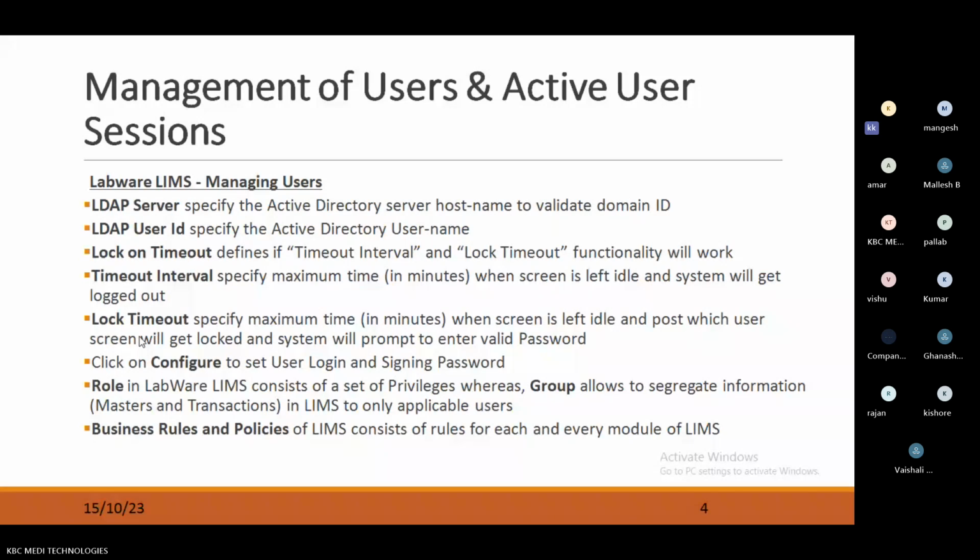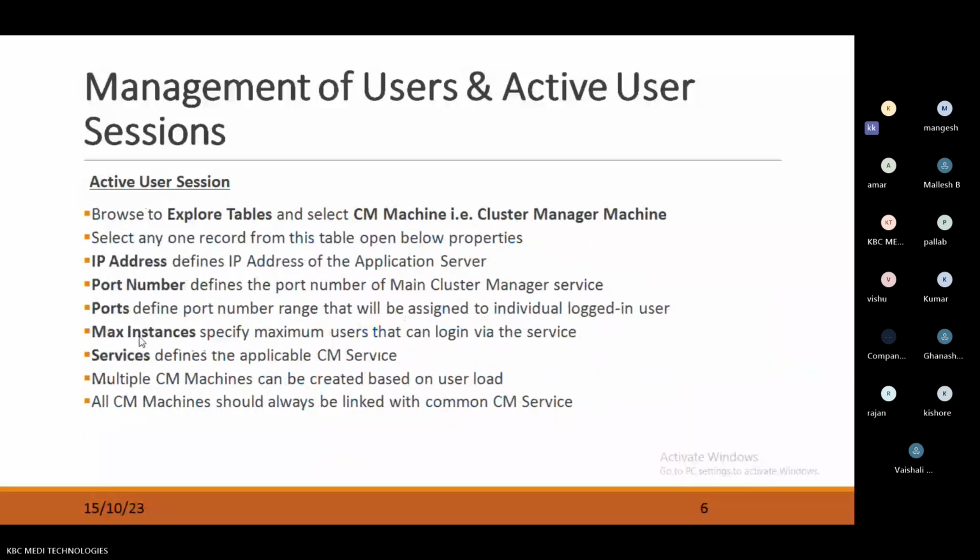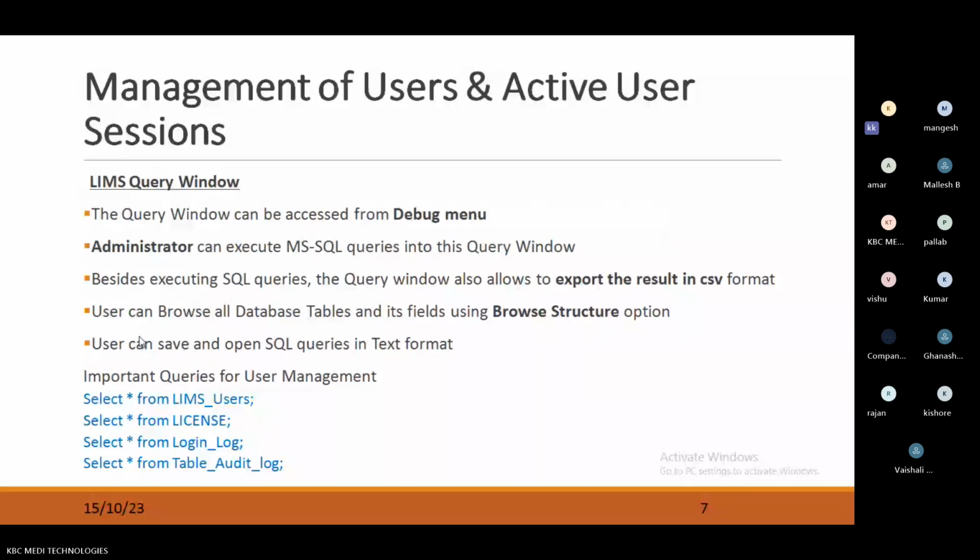Okay. What about business rules and policies? LIMS has different types of business rules. If I want to make a common business rule for every employee, yes, I can. Otherwise, if I want to make business rules user ID wise, yes, I can. That is purely customer to customer; it varies and is not common for every customer.